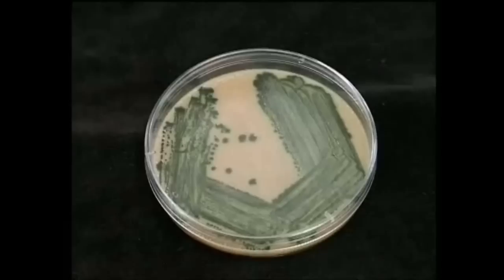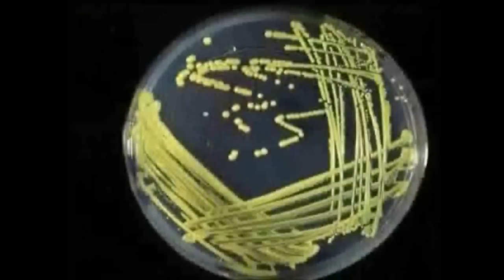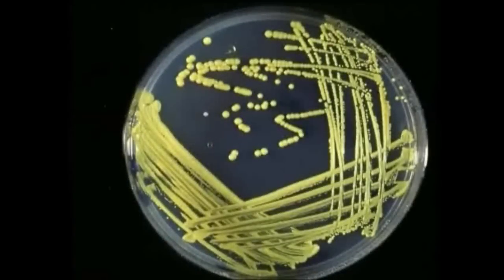Different bacteria may have different colony types, and this colony morphology can also depend on the culture medium used. These differences may be used to help with identification.